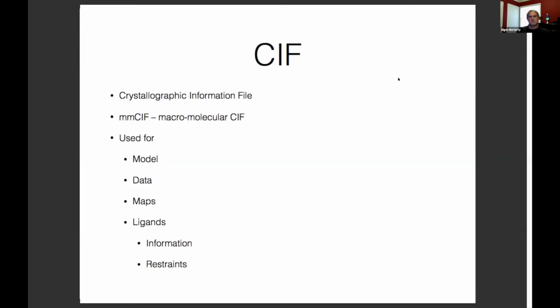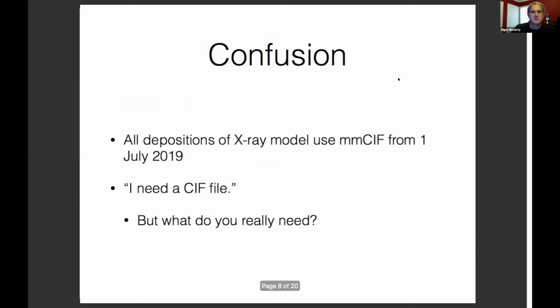This is information about each of the ligands, and actually all entities that have been deposited in the PDB. And you can also have restraints in CIF format, and these restraints are what I'm going to talk about mostly today. But that does cause some confusion.